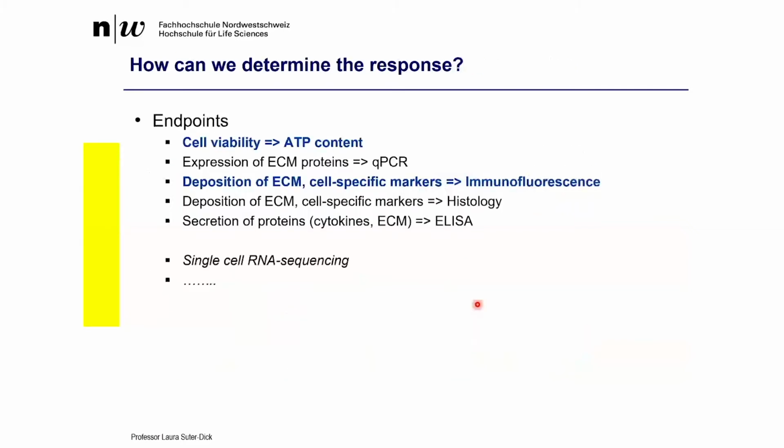The last part of this short presentation, only a few slides now, is how can we determine the response of a model? Once we generated these microtissues, we need to be able to analyze them.